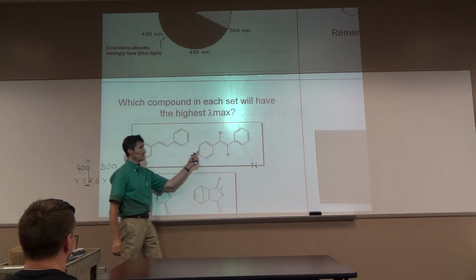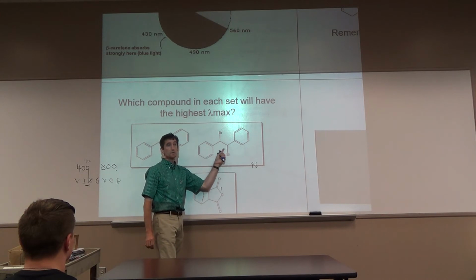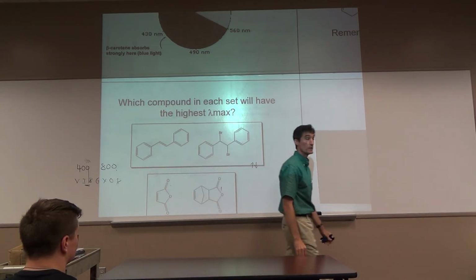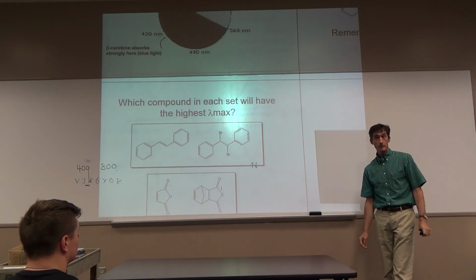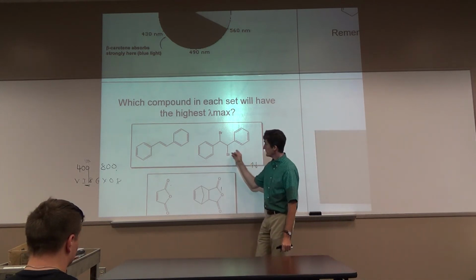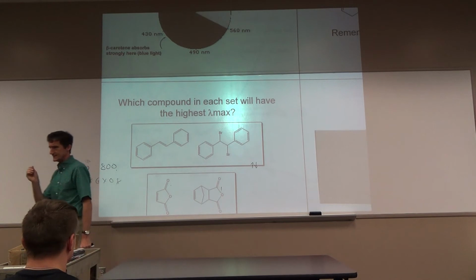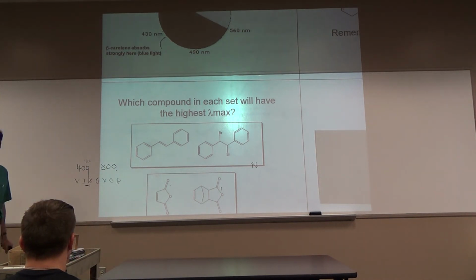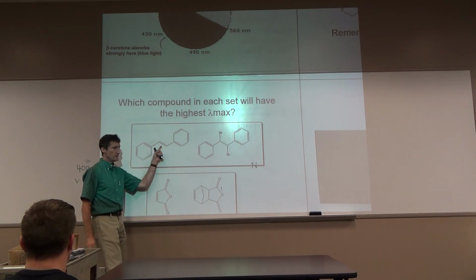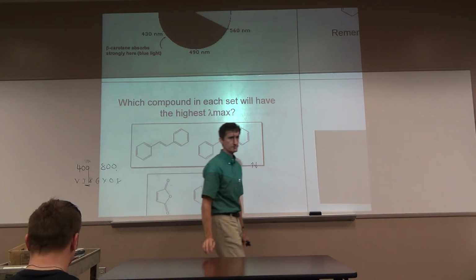What color was your dibromide when you recrystallized it? It was white. Snowy pure white, which is basically colorless. When you melt it, it's colored. What color was trans-stilbene? You may not remember when you weighed it out. It's not pure white. It's got a tinge of yellow to it. It's probably absorbing a little bit into the visible because it's got the extended conjugation and the narrowing of the HOMO and LUMO.